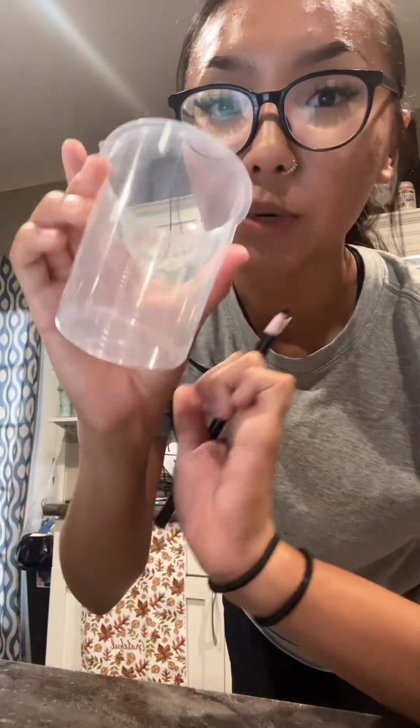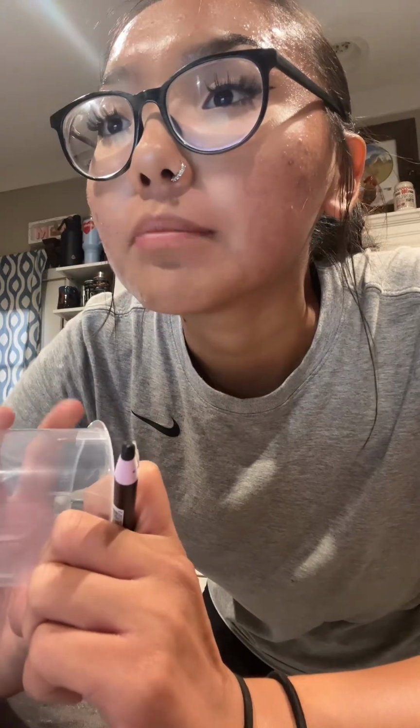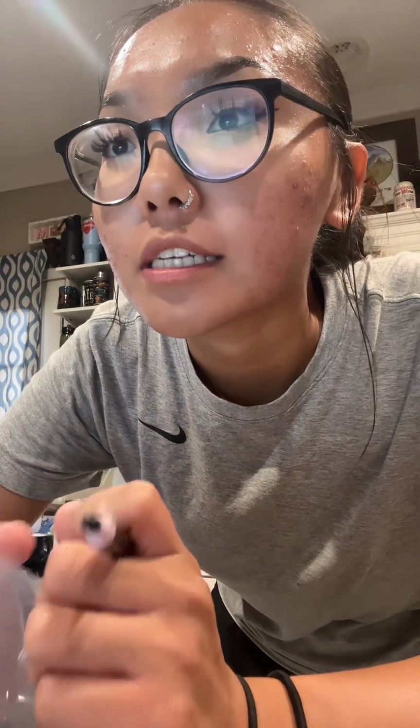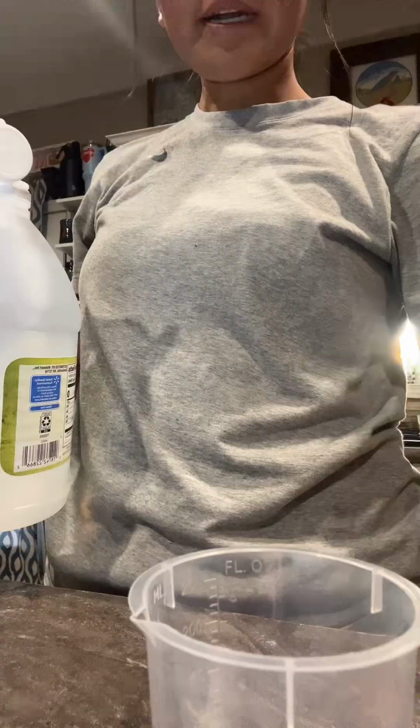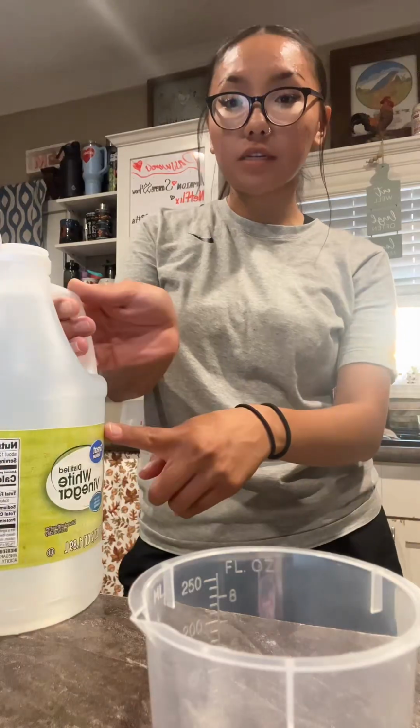Starting off, we're going to label all 3 of our beakers with the wax pencil, and we will label vinegar, syrup, and water. We got those labeled. Okay. Now we're going to measure out 200 milliliters of white vinegar into the beaker.